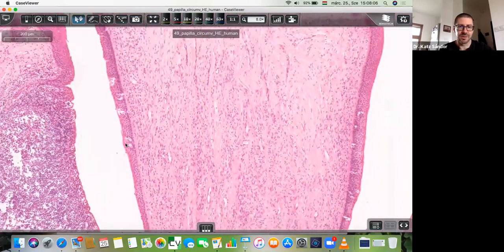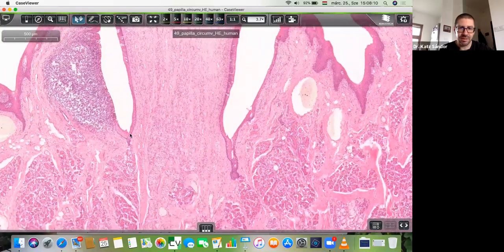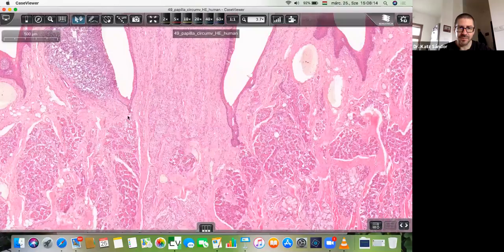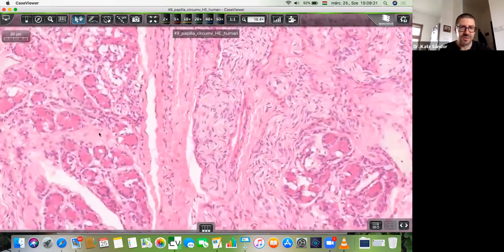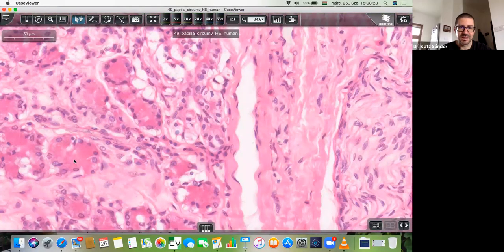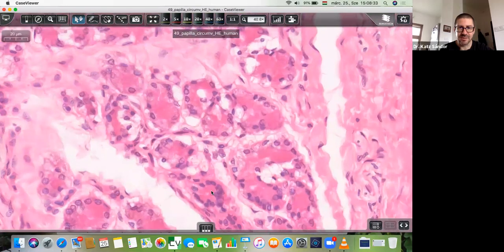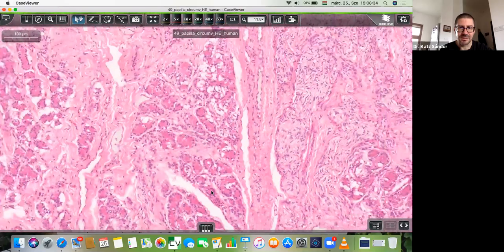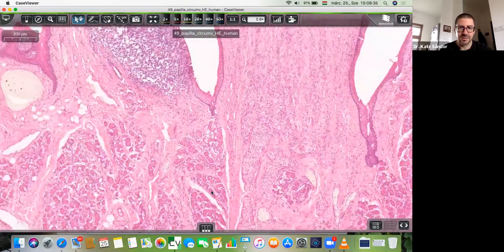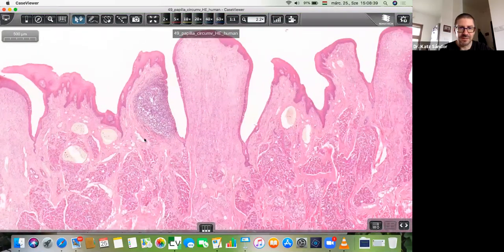And here we have this huge invagination, and underneath these moat-like clefts, we can find the serous von Ebner's glands. So they are typical serous structures. The serous acini are present there, everywhere they are serous acini. So these are the von Ebner's glands.